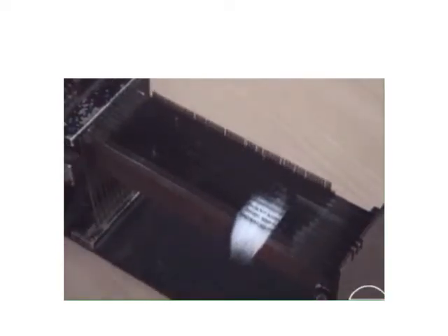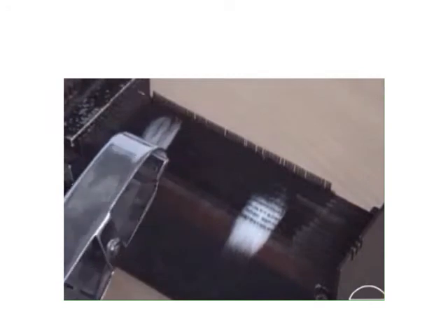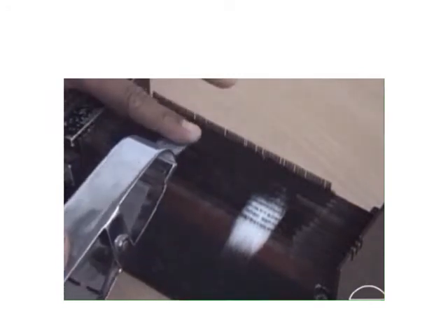Now take the tweezer and pull the fibers and keep it on the left hand side of the bottom comb. Earlier back side, right hand side, now back side, left hand side. This is how it has to be placed, such that the edges of the fiber start from the first comb with the back side.